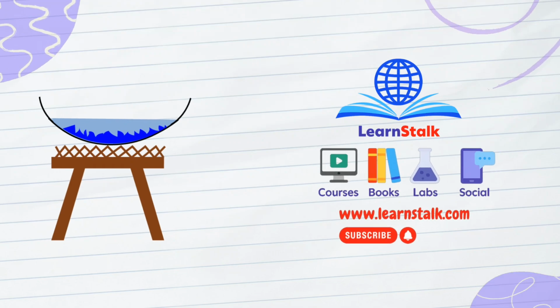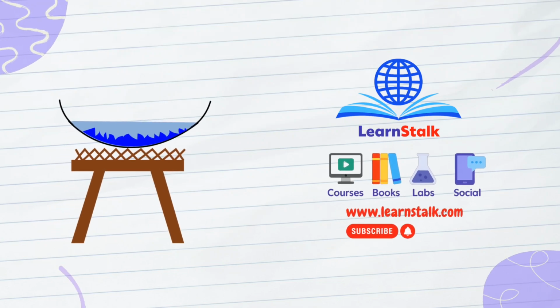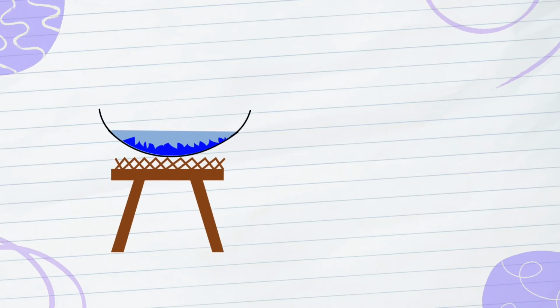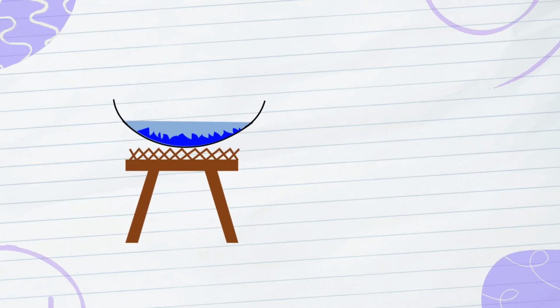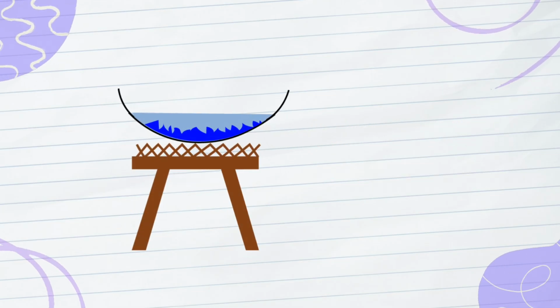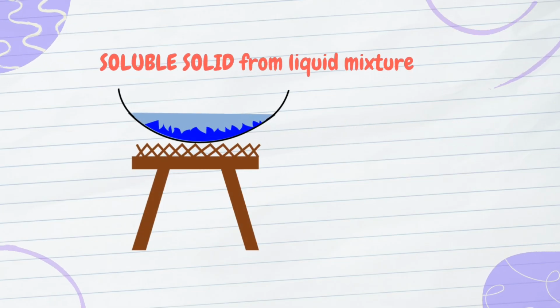What if I told you that one of chemistry's coolest tricks can turn a liquid into dazzling solid crystals, just like magic? This video covers that, a separation technique known as crystallization. Crystallization is used to separate soluble solids from a liquid mixture.